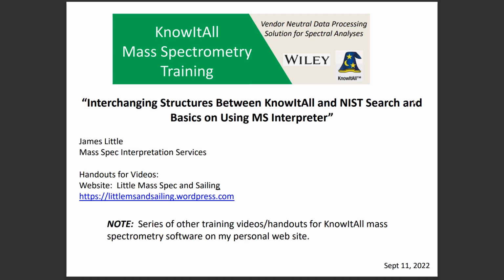Today, I will be presenting a training video entitled Interchanging Structures Between KnowItAll and NIST Search and Basics on Using MS Interpreter. The latter topic, Mass Spec Interpreter, is somewhat of a more advanced topic. This program correlates ions in a user's EI mass spectrum to substructural elements of the associated structure and thus interprets the spectrum. A series of other training videos and handouts for KnowItAll mass spectrometry software can also be found on my personal website.